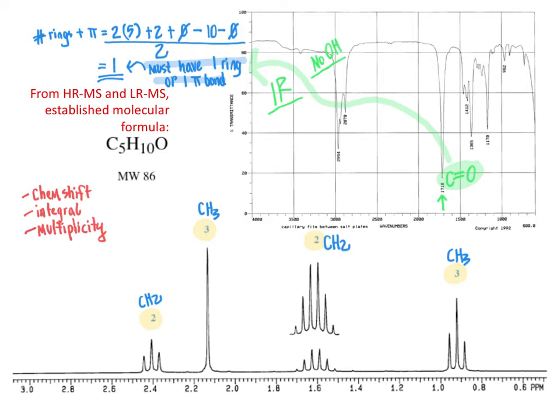Taking a look at this, I like to start sketching things out at an end of the molecule, at the left terminal or the right terminal of the molecule. The nice thing about methyl groups is that the methyl group has to be at a terminal of the molecule. It has to be at one end of the molecule or another.